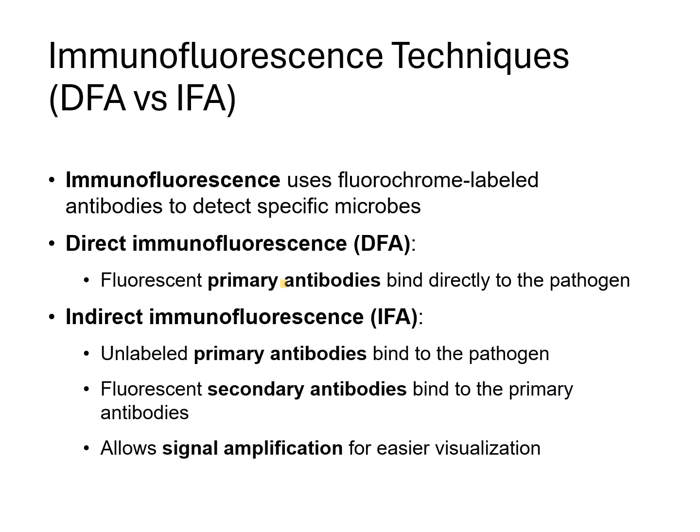We're going to learn more about antibodies when we get to the immune system, but in summary, antibodies are proteins that kind of look like this, that are very specific in what they will bind to. Each antibody will only bind to a specific structure called its antigen. And immunofluorescence takes advantage of this, in that you can make immunofluorescent antibodies that bind to a target structure. For example, you can use these antibodies to see if a pathogen is present or to highlight specific cell parts, like the cytoskeleton of a cell.